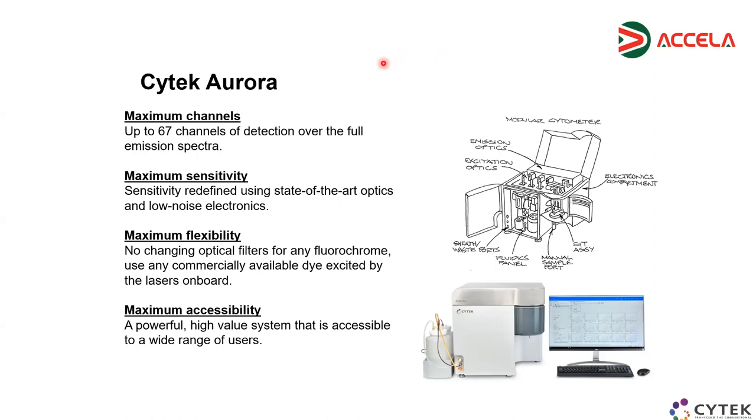So first of all, the 96 well plate is automatized. Thus, I can kind of leave the machine there. But based on the question of the previous person, it means you can't really read the 96 well plate if you have different dyes. So you kind of need to add some wells with this cleaning, bleach or something with it, or I misunderstand something. So you just compromise and you can add some clean wells, yes, if you want. Why not? I mean, you can.